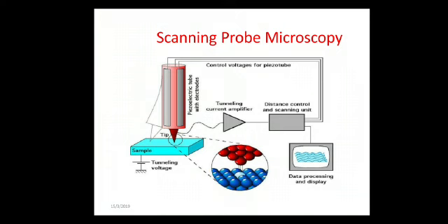Scanning probe microscopes can detect differences in height that are a fraction of a nanometer, smaller than the diameter of a single atom. The tip is moved across the sample many times. This is why these are called scanning microscopes. A computer combines the data to create an image. The images are inherently colorless because they are measuring properties other than the reflection of light.